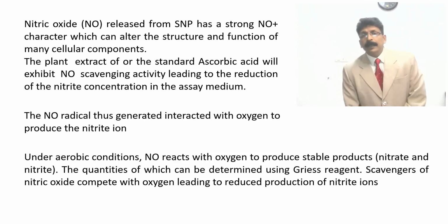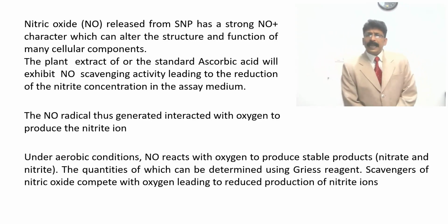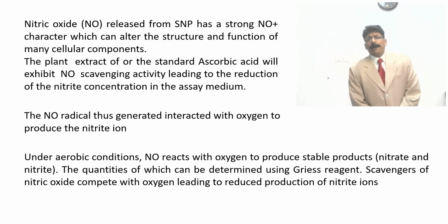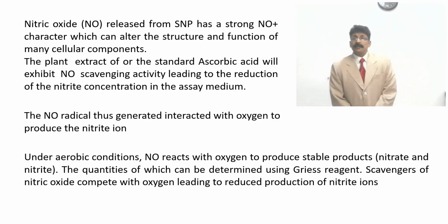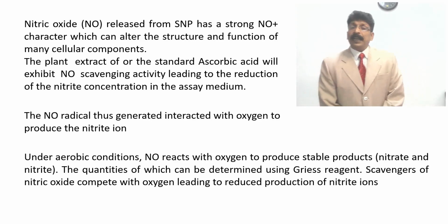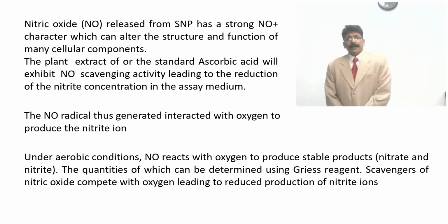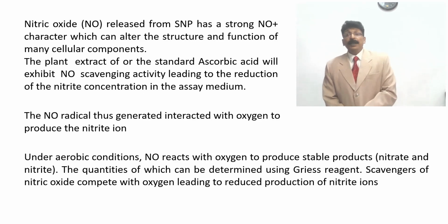That is how we find out the antioxidant effect of my plant extract. Here we have taken the seeds of Melia dubia and extracted them by the continuous Soxhlet method, and we have taken various dilutions and made the test, comparing with the standard of ascorbic acid. So I have given you detail about this small information. I hope it will be helpful for the students.